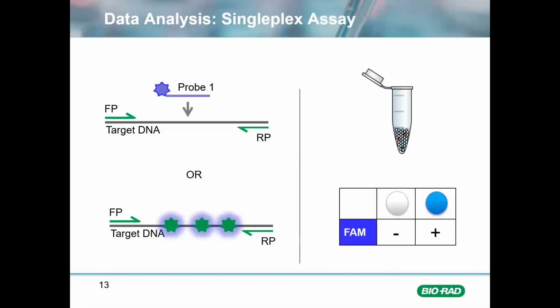So if we start very simple with a singleplex assay, we can use either probe-based or EvaGreen-based chemistry. And we're expecting in this case, because we're looking at a single target, to get 2 populations of droplets that are either positive for FAM, or droplets where PCR occurred, so positive for FAM or positive for EvaGreen, and then droplets that are negative for fluorescence, droplets that did not contain our molecule.